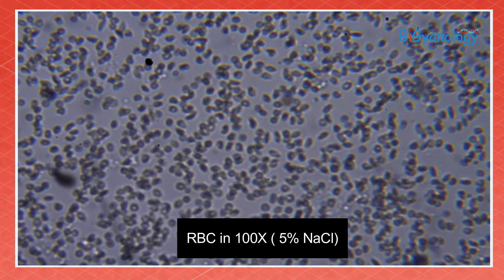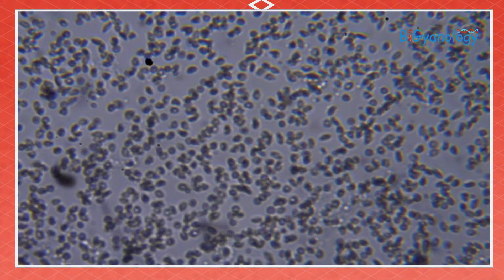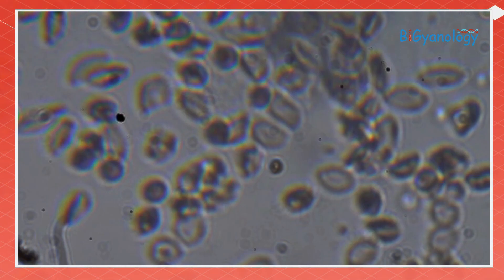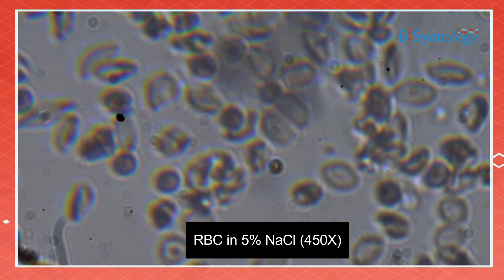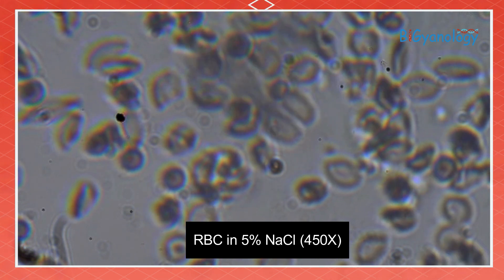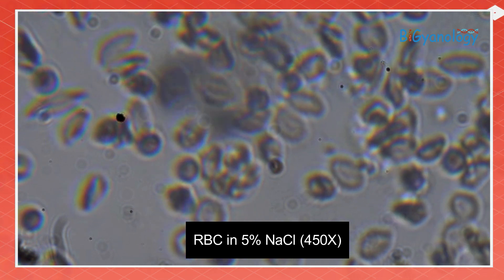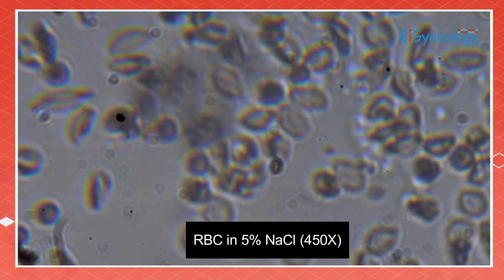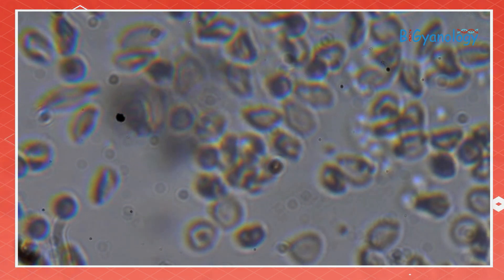Let's see what happens in 5% NaCl. You can see the RBC is a little squeezed. In high power, you can see the shape of RBC is no longer a smooth round shape — it's crumpled and distorted because of the high salt concentration. The water came out, so the plasma membrane is squeezed.